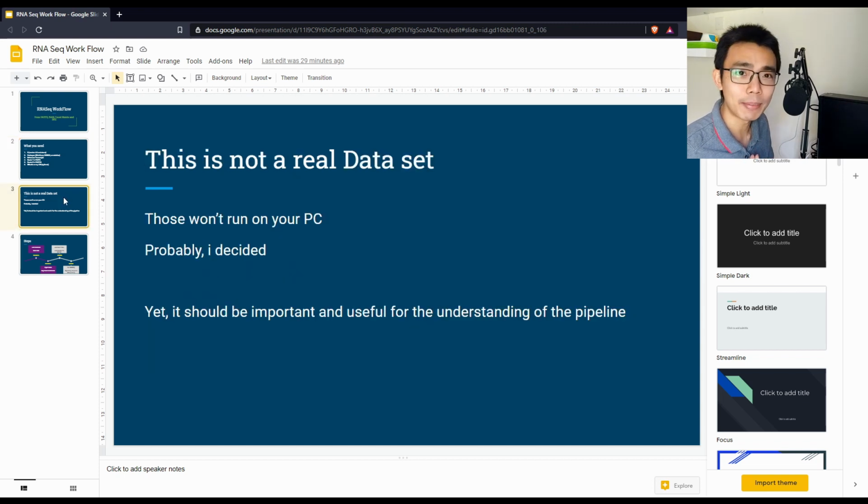So again, disclaimer, this is not me going through a real research data set. This is a stripped down version of the sample file that I found based on the tutorial from other authors. I will credit them, and their original content and documentation will be in the video description below.